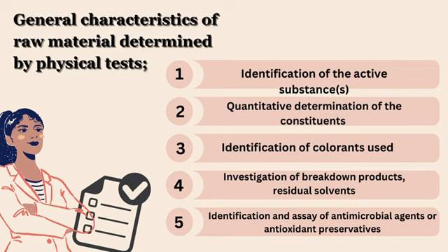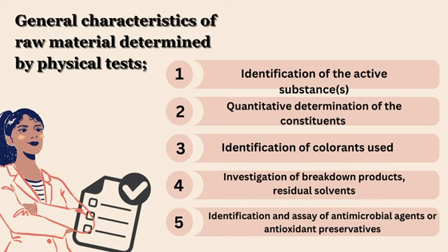1. Identification of the active substance. 2. Quantitative determination of the constituents. 3. Identification of colorants used. 4. Investigation of breakdown products, residual solvents. 5. Identifications and assays of antimicrobial agents or antioxidant preservatives.